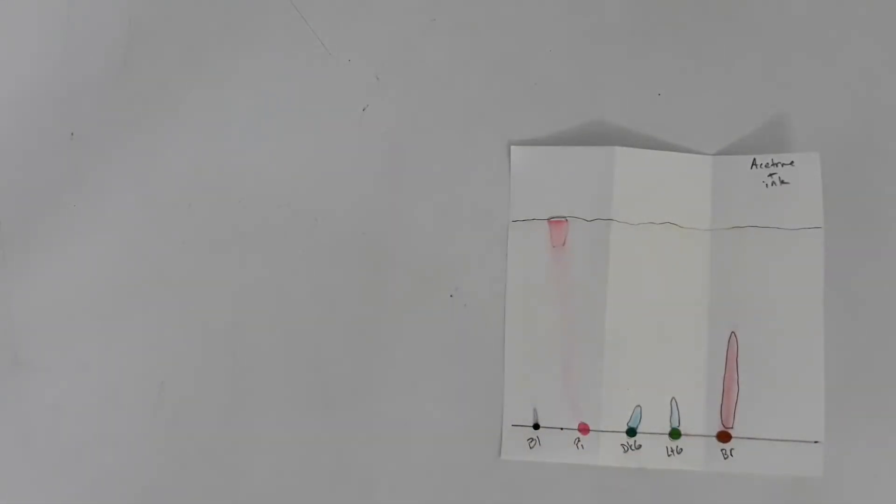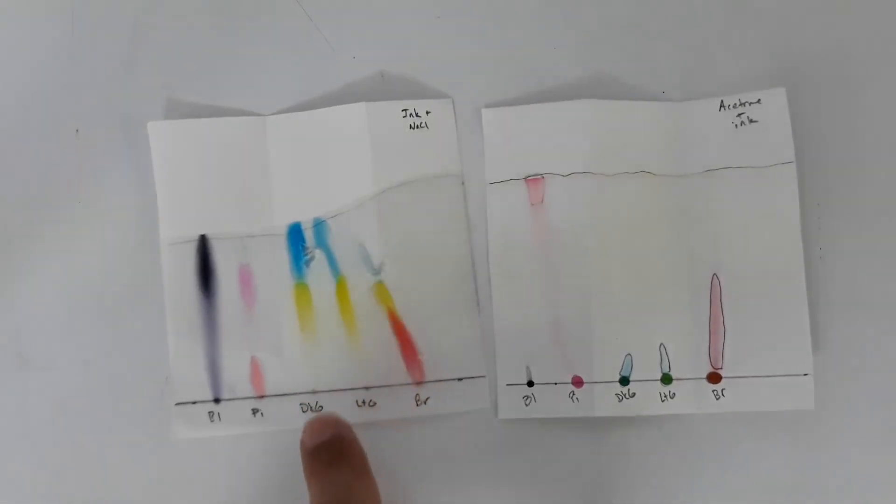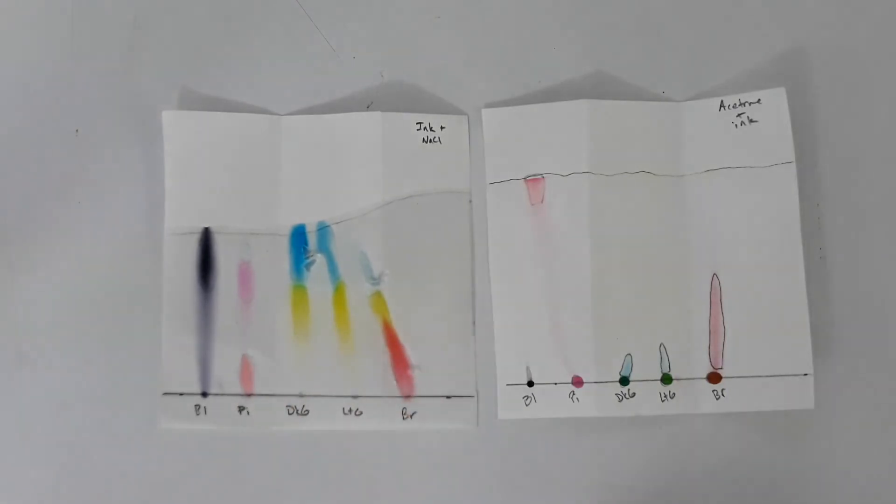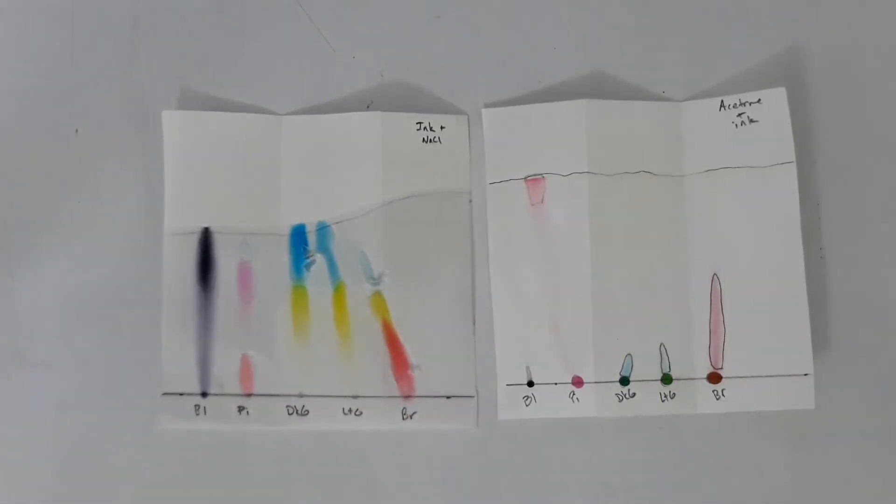So it's really important to mark those colors and here you can see it is, it's already started continuing moving up the page. My solvent front is not level there but that's okay. We will analyze these in the lab and see what we come up with.